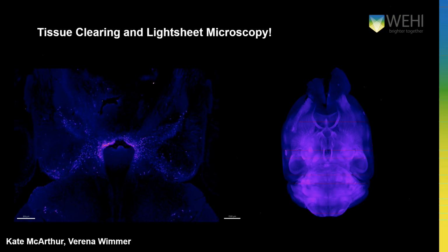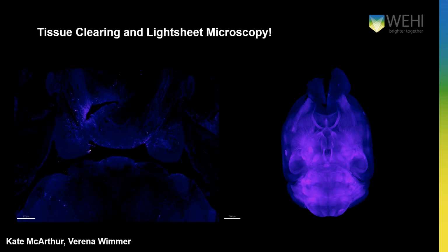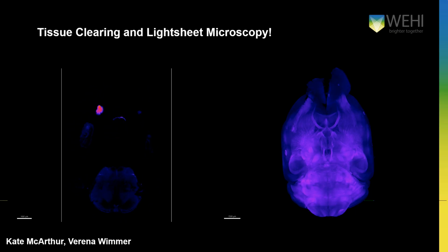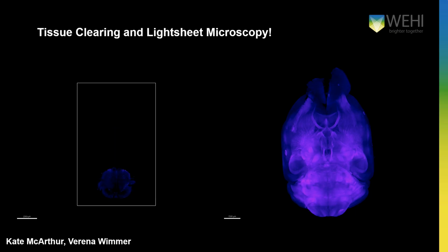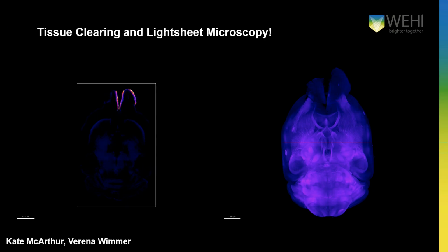And just for a bit more context, the pixel size, or voxel size, is roughly 2 micron in X, 2 micron in Y, and 7 micron in Z. So they're really, really small, especially when you consider that this is roughly a 1 centimeter cubed volume in total.